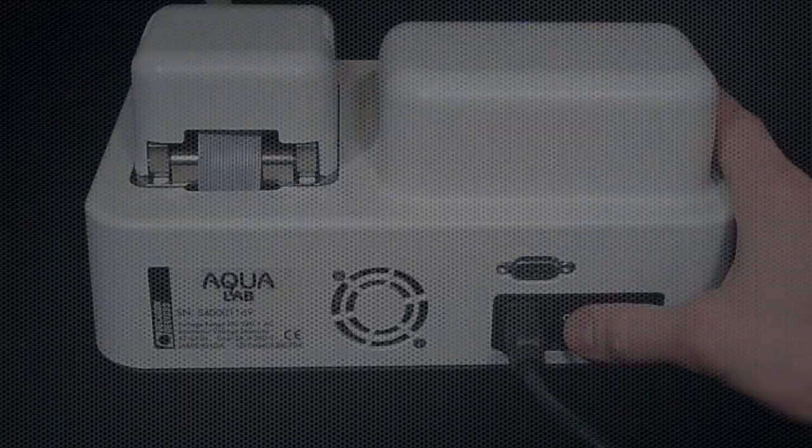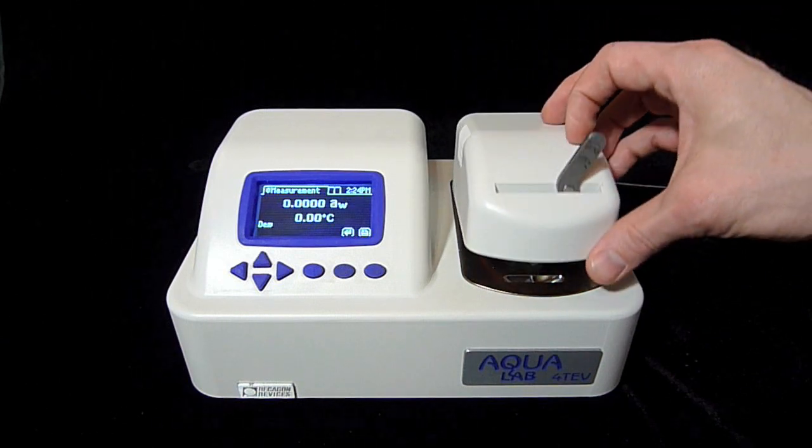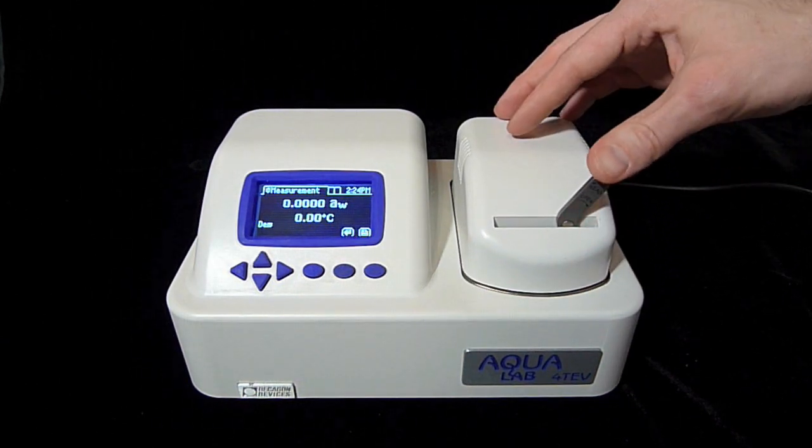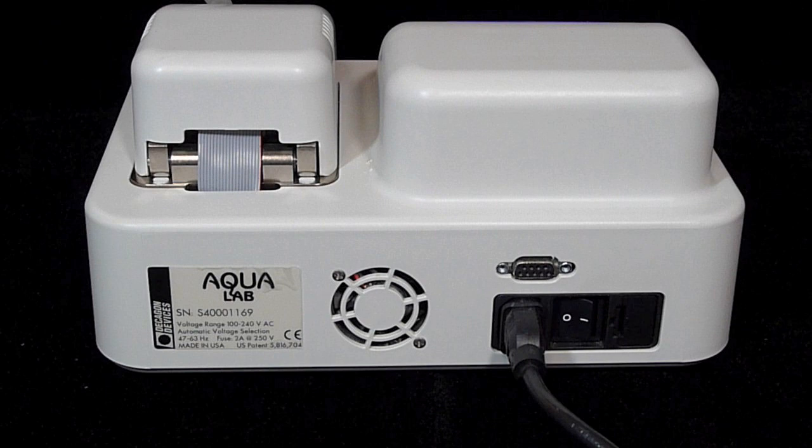This instrument is almost foolproof. Turn it on, put in a sample, close and lock the chamber, wait a few minutes, and get a water activity reading accurate to plus or minus 0.003 water activity units. This video will show you how to make sure every one of your water activity measurements is fast, accurate, and clean.